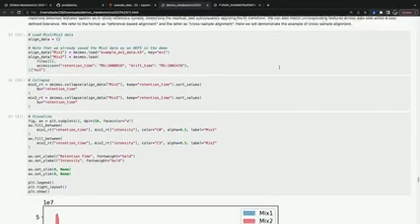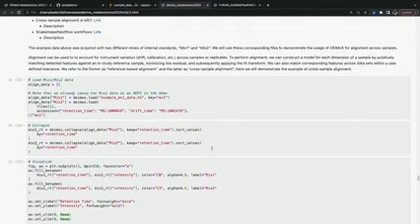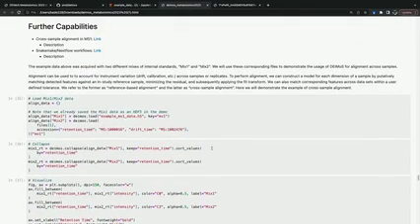Yeah, so we included an example of cross-sample alignment in DEIMoS, so we can go through that example. If you're interested in that, you can look through the code in the notebook, but we don't have to go through it specifically, and it's also in the documentation. Any questions?